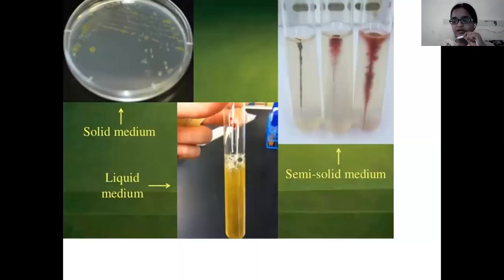Okay, so here we are seeing three different types of media. This is the solid media. This is the semi-solid media, where we can see the motility of the organism into the depth of the tube, and this is the liquid media.